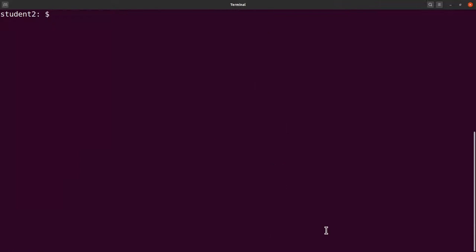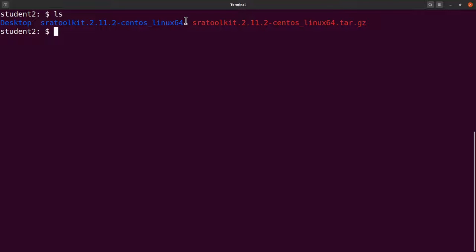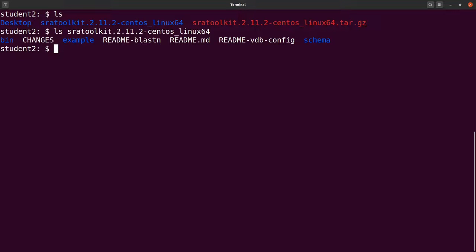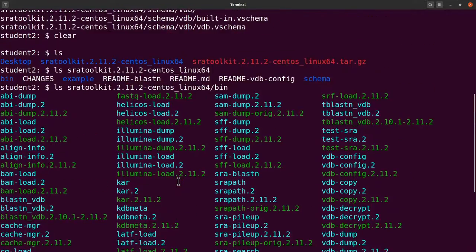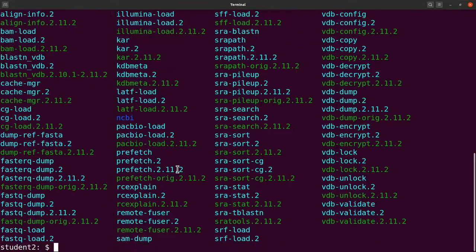Extraction is complete. Do an ls and you'll see the directory — this contains the binaries. Let's ls that directory and we have the bin folder. Let's ls into that bin as well and we have the files. The binaries are here — that's what we need. We have a number of files: fastq-dump, prefetch, and others.